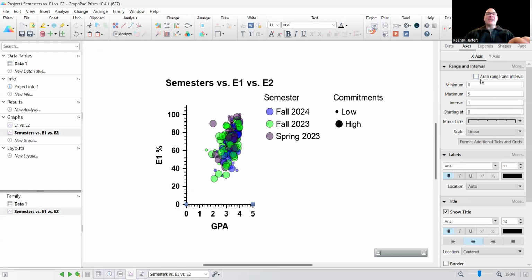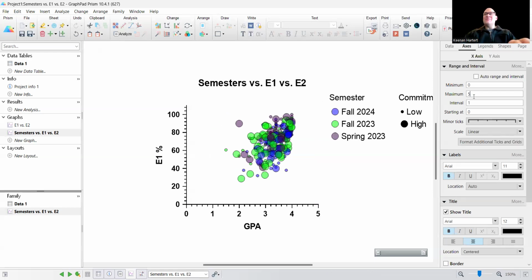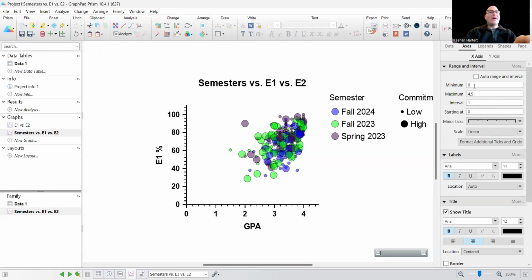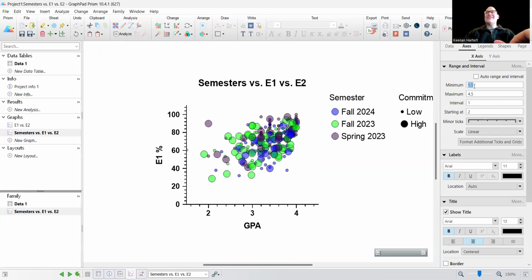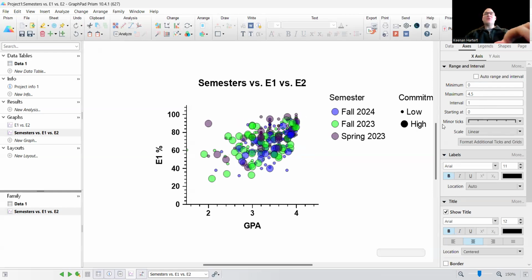So in this case, I would actually want to spread these out just a tad. Give me a little more on here. Maybe give myself a 4.5. Maybe start at, what is that, a 1.5? I think I just cut one off though. Did I? Nope, there it is. I'm going to keep that. Perfect. All right. Now I can see something like this. And again, there's some clicking over here and such, but look how it just auto adjusted to whatever I wanted.